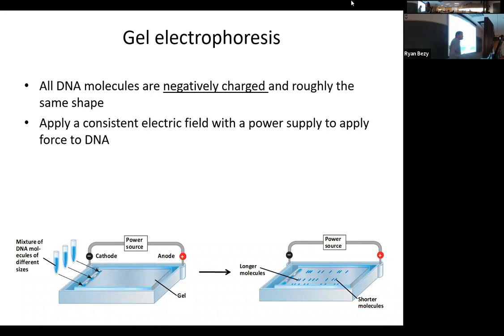But DNA is negatively charged, as I said. So how does a negatively charged DNA interact with the negatively charged field here at the top? What ends up happening? Negative charges do what to one another? Oh, they repel one another. So by putting a negative charge over here at the top of the gel, it pushes the DNA down away from there. And it's also simultaneously getting attracted to the positive charge, because unlike electrical charges are attractive to one another.